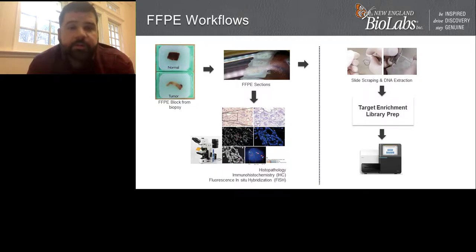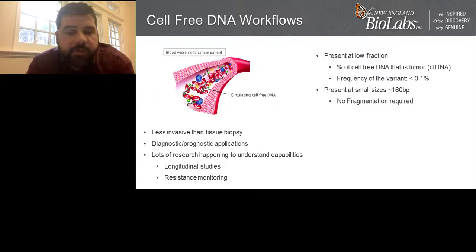Talking a little bit about cell-free DNA workflows, I think this is a very popular and very hot topic because of the potential of this. Obviously, being able to look at DNA that's being shed by a tumor as it's going through metastasis has some great advantages in terms of being much less invasive than a tissue biopsy, depending on where the tumor is. Looking at this for diagnostic and prognostic applications, if you could have a blood test that tells you whether you have the potential to develop a cancer over time, the value of that information is huge.